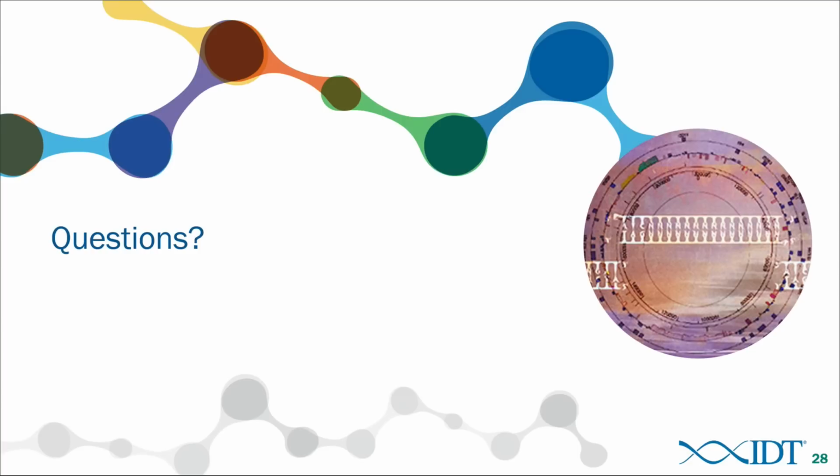Okay, we've covered this. Let's see here. Do we know anything specifically about whether Cas9 is a multi-turnover enzyme or a non-turnover enzyme? I had to ask for a little clarification on the usage of the term here: whether Cas9 is basically able to cleave one site, and then if there's another site that it also recognizes, can it cleave more than one site within the cell?